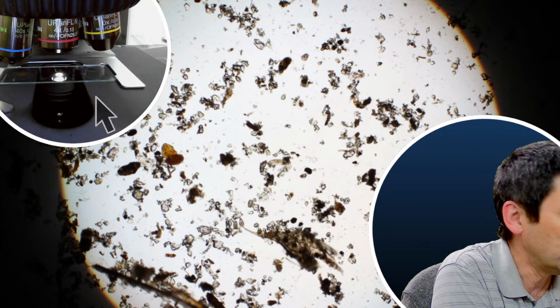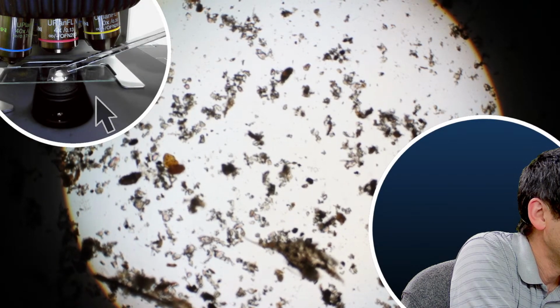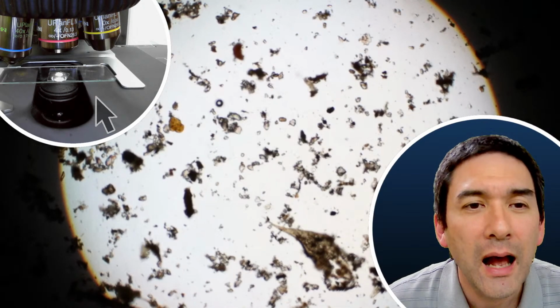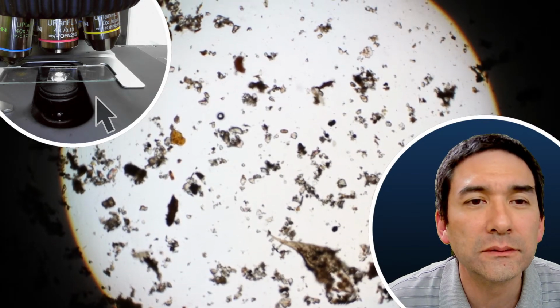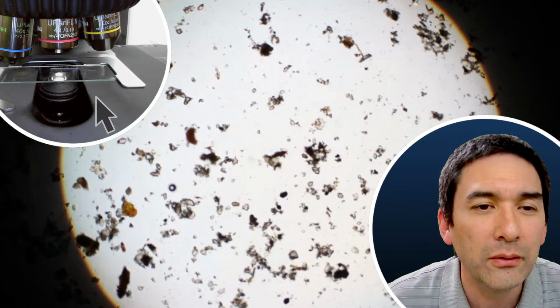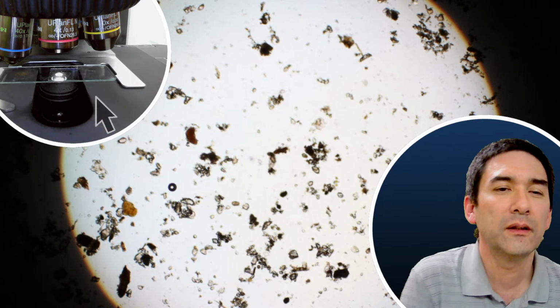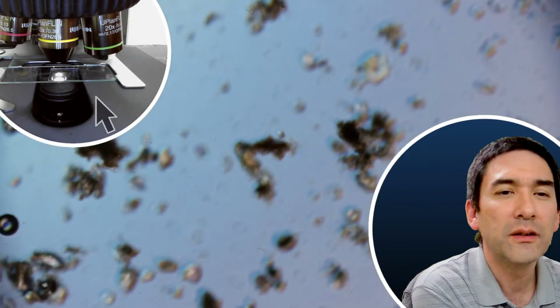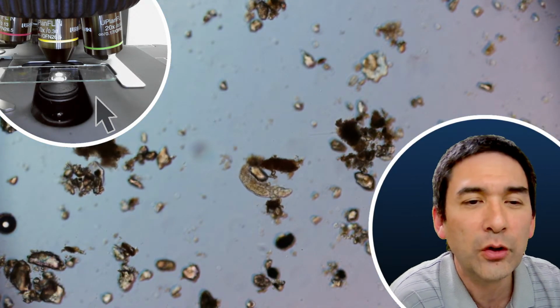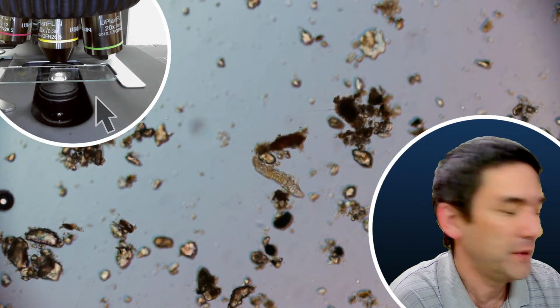The tardigrade is now right in the center, but it's going to be flushed away now. Do I still have it there? Ooh, okay. It might still be there. It's a little bit out of focus now. And let's see, because yes, it's still here. That's great, because now I can really go up with the magnification. That's nice. Okay. So luckily, it's still there.